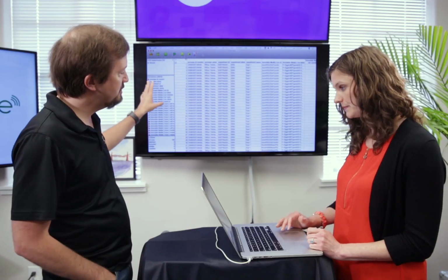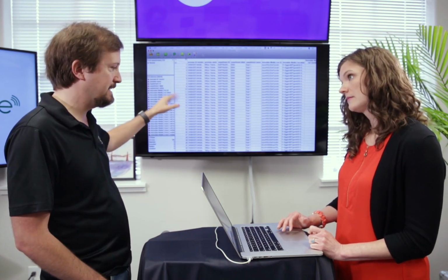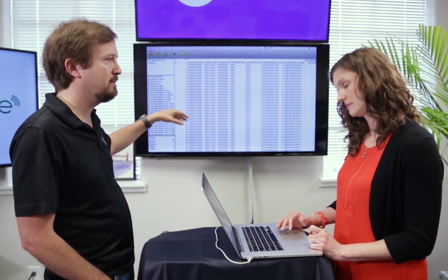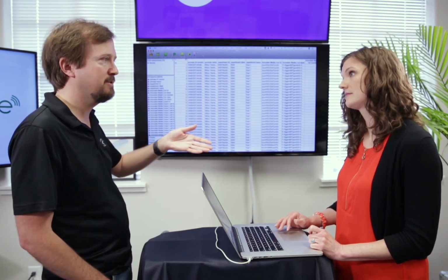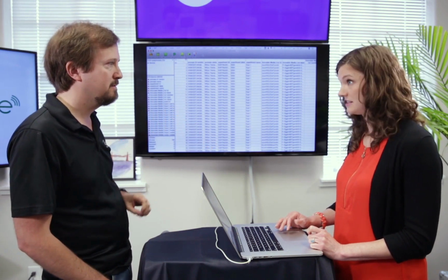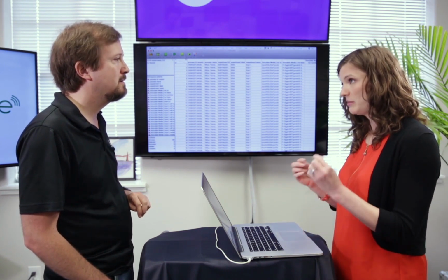So what Riffyn's allowed you to do is to really look at everything visually, collect all the data, tag it, annotate it, collect all the instrument data, all the strain data, all the metadata associated with it in one place, and you wouldn't have been able to do that before. Yes, that's right. So after you put the data in Riffyn, it'll get automatically joined.